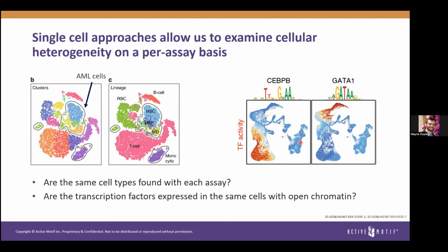And with these transcription factor data, we know that there are peaks that this transcription factor could bind to, but that doesn't necessarily mean that that transcription factor is actively doing something at this moment. It could be that those cells are primed, that if some type of stimulus turns on GATA1, then they can have a response, but it doesn't mean that GATA1 is doing something right now. And so that's why we really need to focus on moving into multiomics approaches, where we can look at multiple different assays together and get a whole picture of what is happening in a cell.